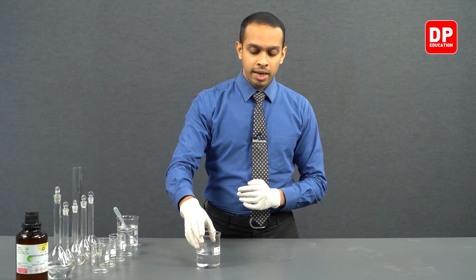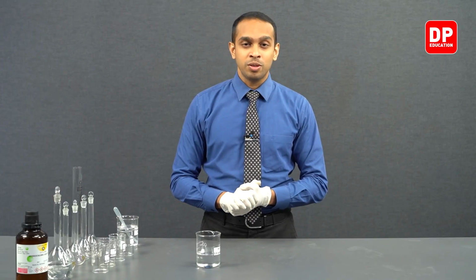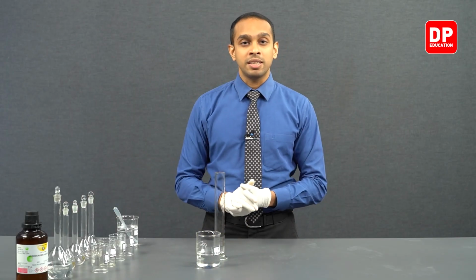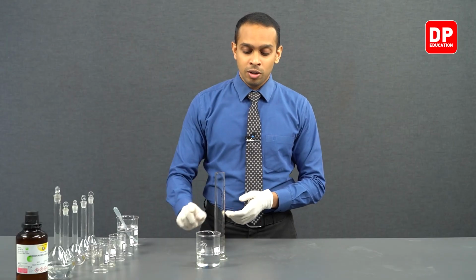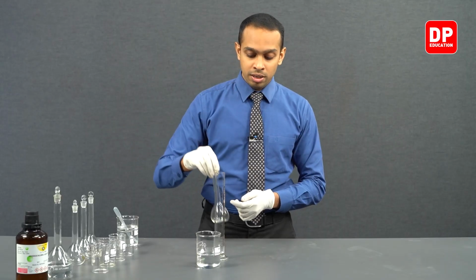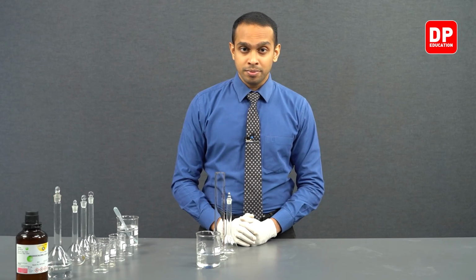In this beaker we have our 1 mole per decimeter cubed concentrated HCl solution, and using a measuring cylinder we are going to measure 80 milliliters of this HCl solution and transfer it into a 100 ml volumetric flask.